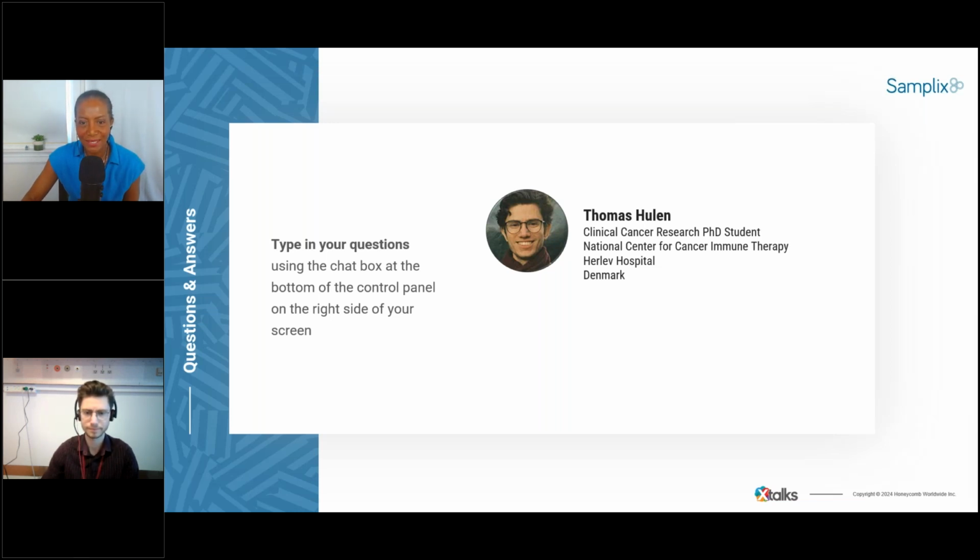Okay, perfect. Thank you for that, Thomas. I'm just getting through the questions here. Let's go to this one here. This audience member is asking, is the droplet production protocol different depending on the experiment? In other words, are droplets made with the same reagents for all experiments, or do different droplet kits need to be purchased depending on the experiment? That's a very good question. What are your thoughts on that, Thomas?